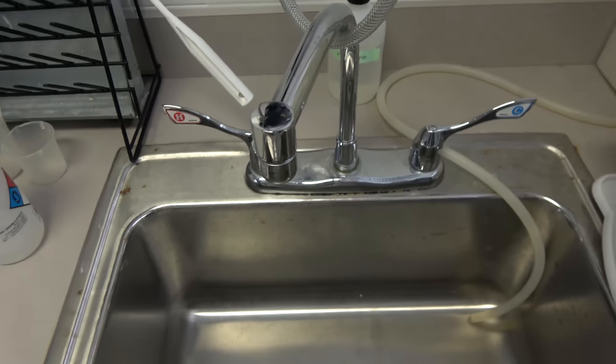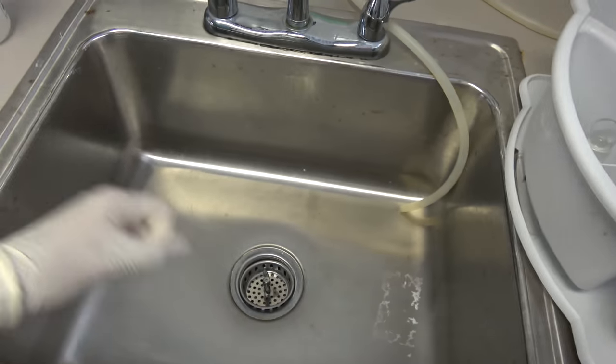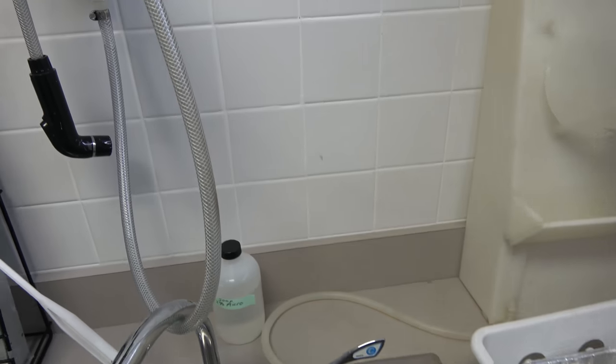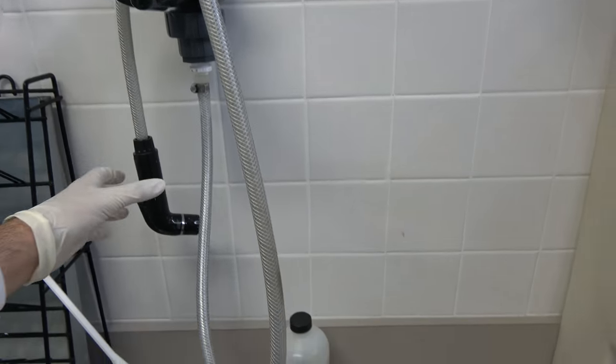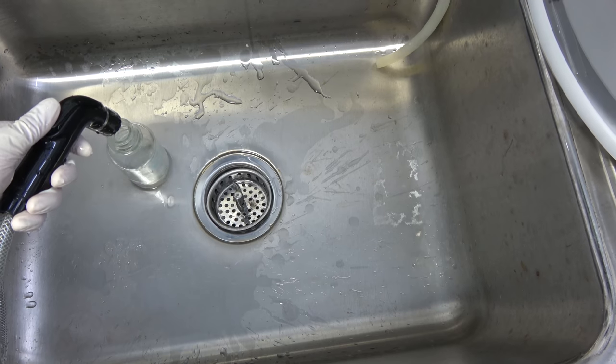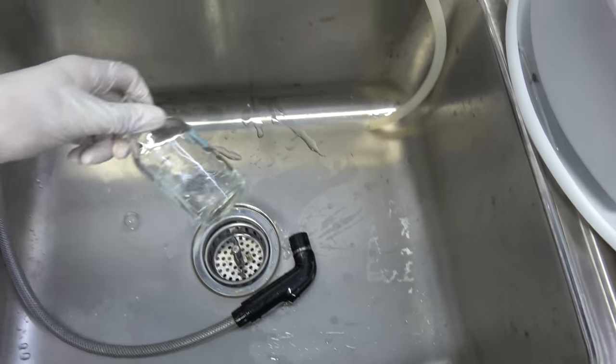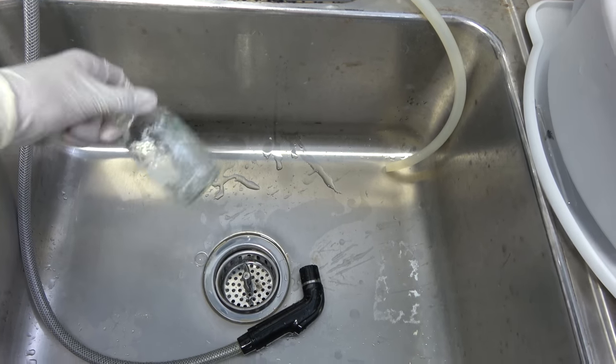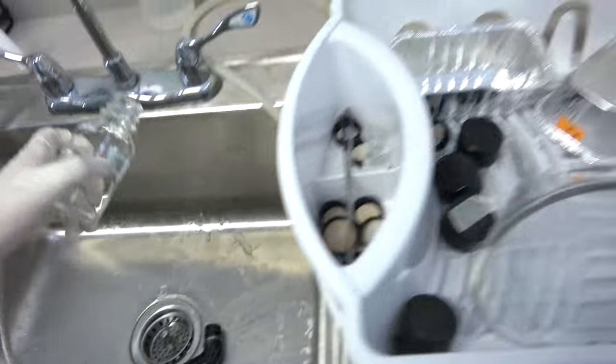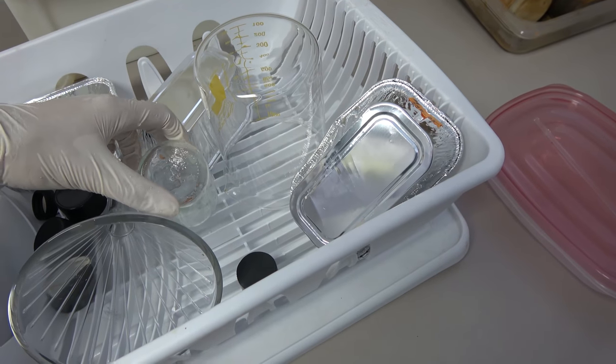Now the thing about the DI water tap is that this shit is very, very expensive. You don't just want to turn it on and be like cleaning everything like waterfall. No, you don't want to do that. So what you do instead is that you put in like just about a quarter of distilled water and then you shake it up like this and then you do that two more times. And then after that when you're done, you leave it out to dry.